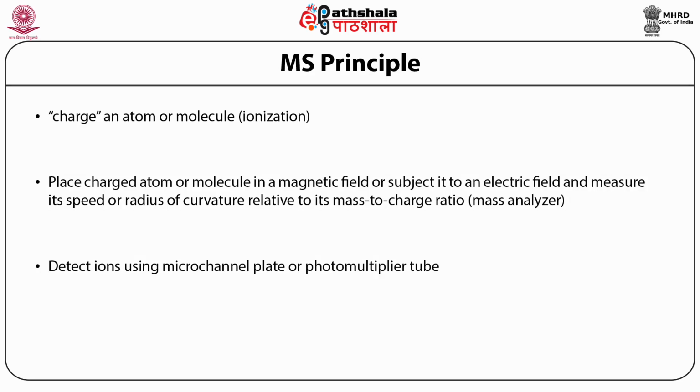Basic principle behind mass spectrometry. For mass spectrometry analysis of a compound, the sample has to be introduced into the ionization source of the instrument, and production of gas phase ions of the compound is done by electron ionization. For this, the sample passes through an electron beam which knocks off some electrons from the molecule and turns them into ions.